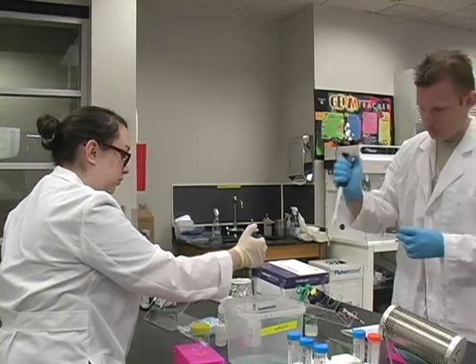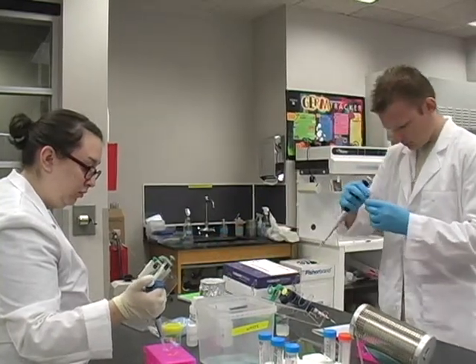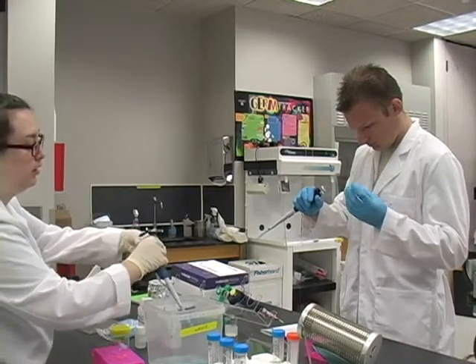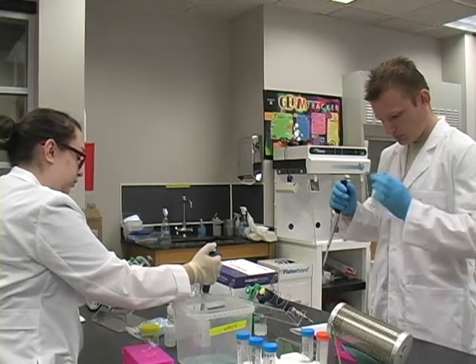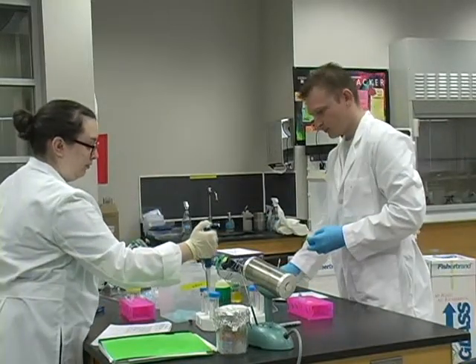To isolate the plasmid DNA, what they're going to do is they're going to break open the bacteria cells and then they're going to have the DNA bind to a material known as silica, which is a proprietary reagent from the company.